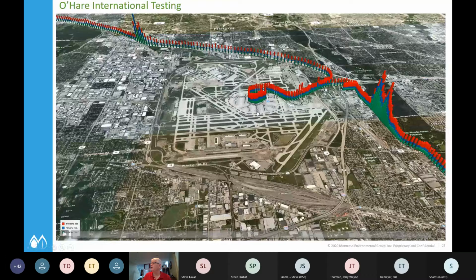If you step back and look at it, you saw those peaks on the previous data, but when you actually go back and put them against their geographic location, it tells you a wealth of information. So this one in particular here, this is the huge hit of xylenes that we saw. And actually, you can't see it, it's on the other side of the graph, but there is a huge road construction project going on, and there were tons of semis full of asphalt and bulldozers and stuff. So the background levels of xylene and toluene there were just really, really high, and that's what we're seeing here.